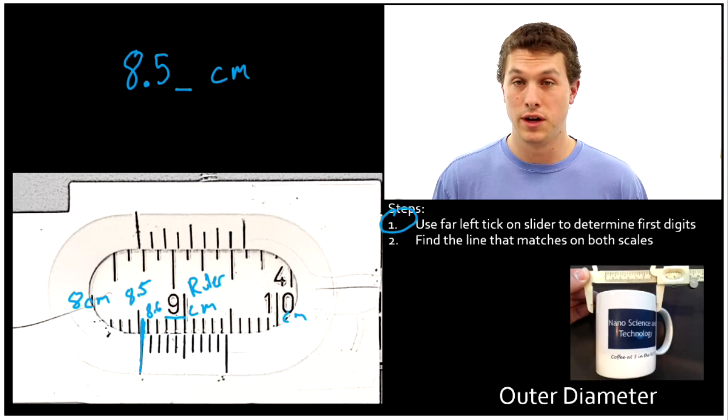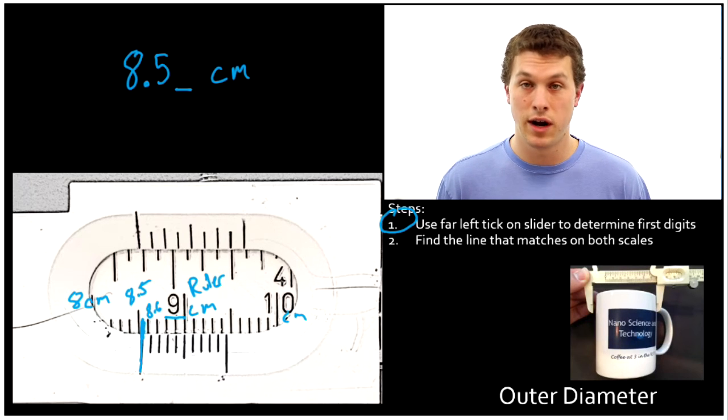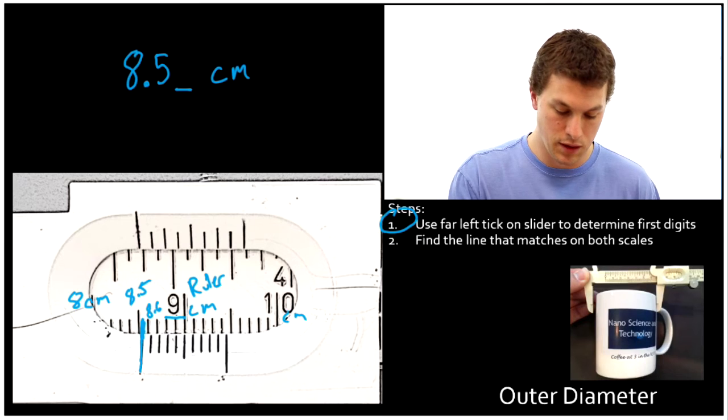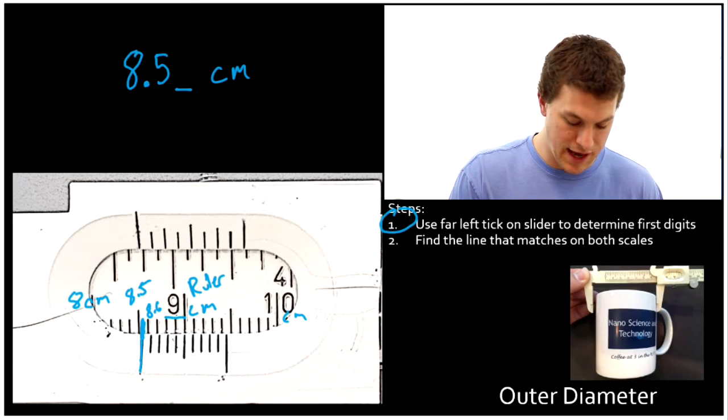The first two digits are pretty straightforward. It's basically like using a ruler. You just see where that left tick lines up, and that tells you the first two digits. But how are we going to get the next digit? That's where the vernier scale really comes into play.